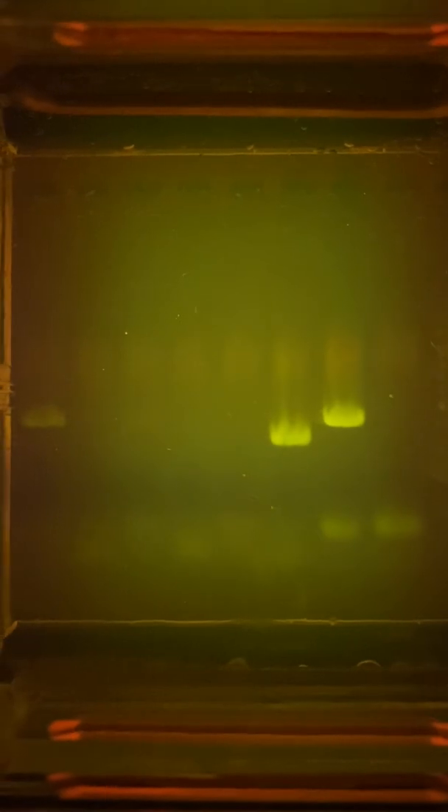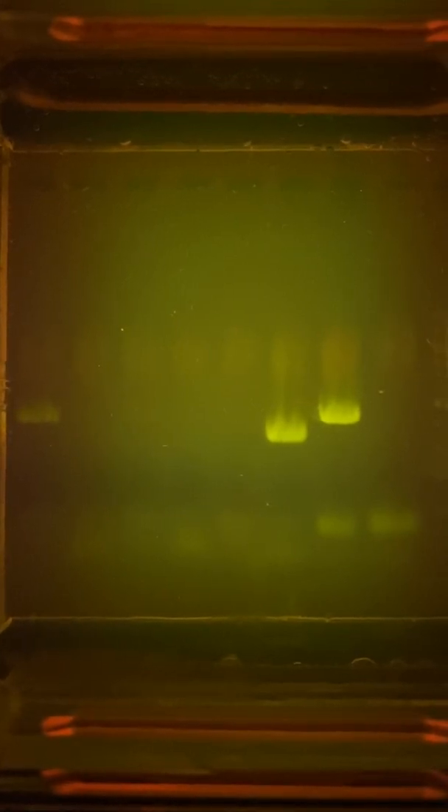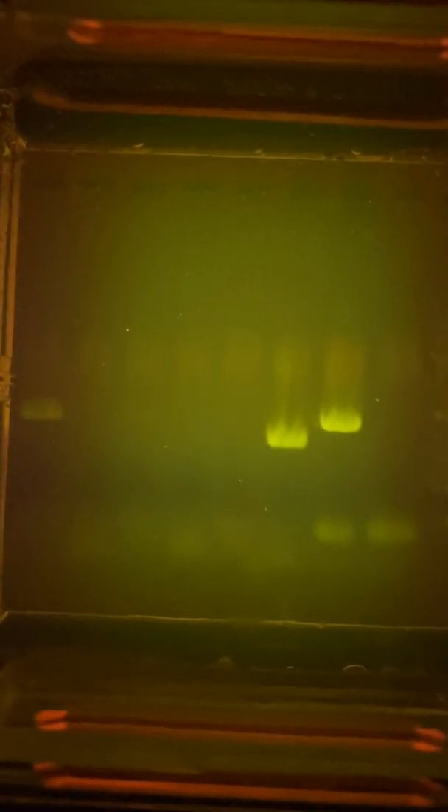What we're looking at is molecular identification of mating types in Cordyceps militaris. You don't need to sequence the DNA to do this — you can just identify it through gel electrophoresis. The Mat 1 mating type is closer to 500 base pairs, and the Mat 2 mating type is closer to 250 base pairs, which you can tell from the two brighter bands on the right side. The one that's not down as much is closer to 500, and the one that's down a little bit more is closer to 200-300 base pairs, which is about right for the Mat 1 and Mat 2 genes in Cordyceps militaris.